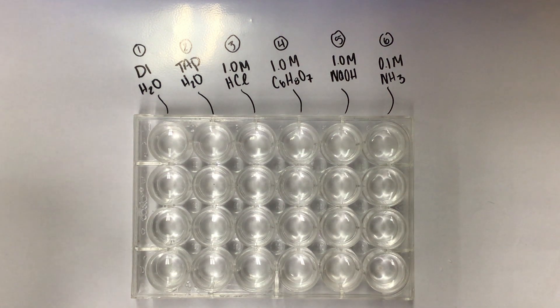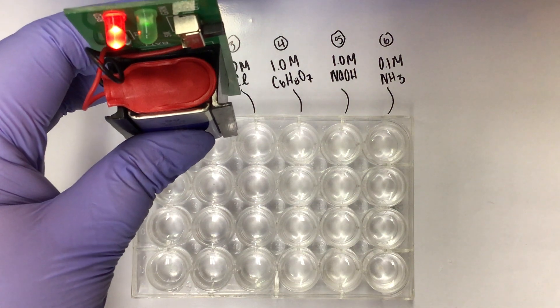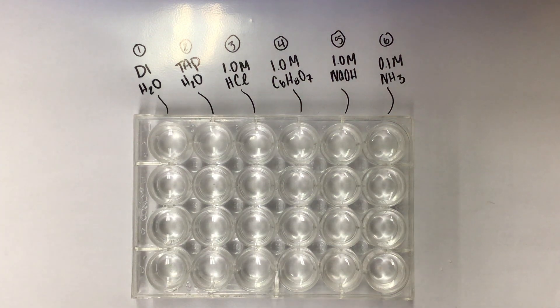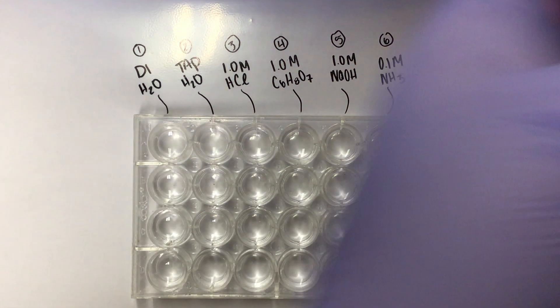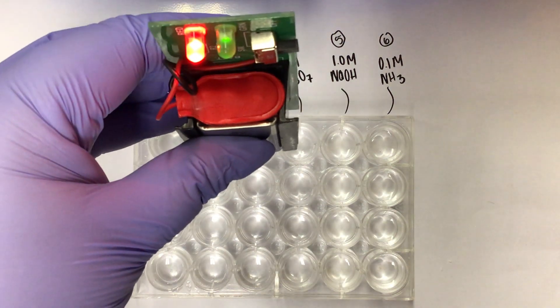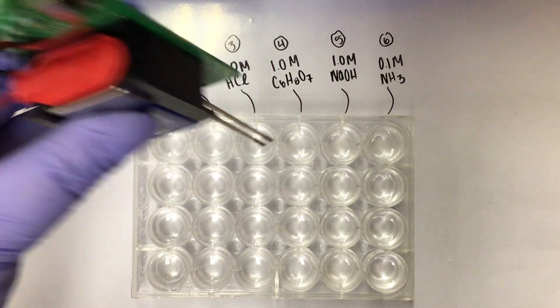Next I'm going to do the tap water. Both of our light bulbs light up, so highly conductive. I'm going to rinse now with water before I do the next one. The next one is 1 molar HCl. Both lights light up very bright, highly conductive.